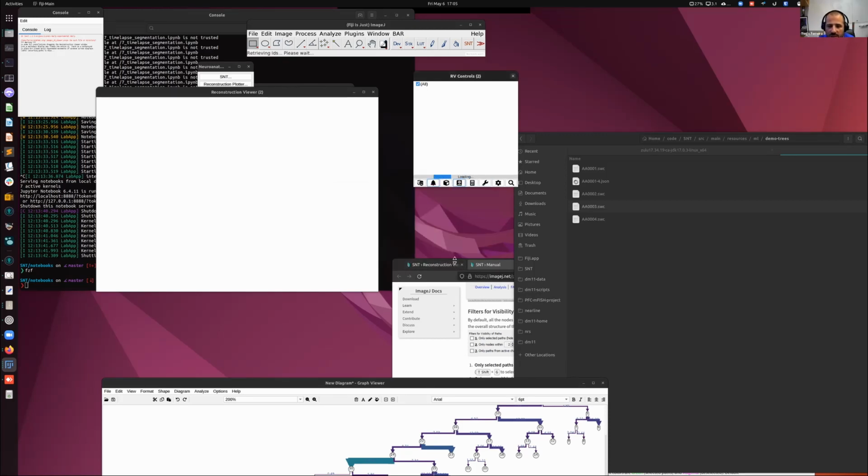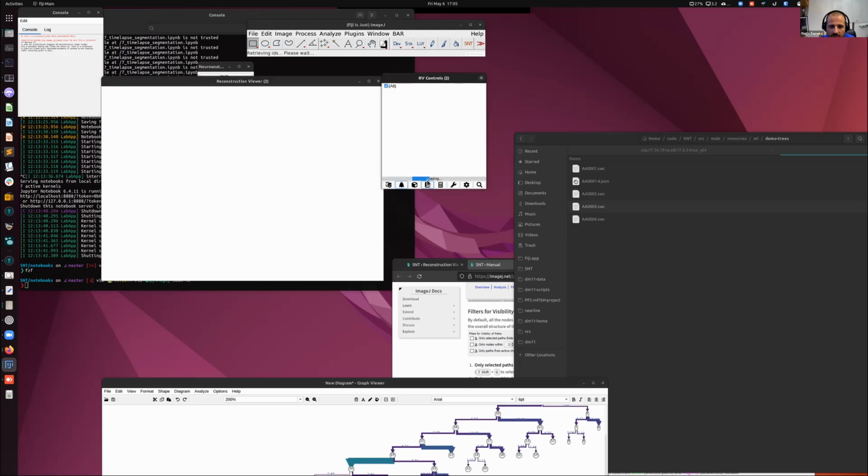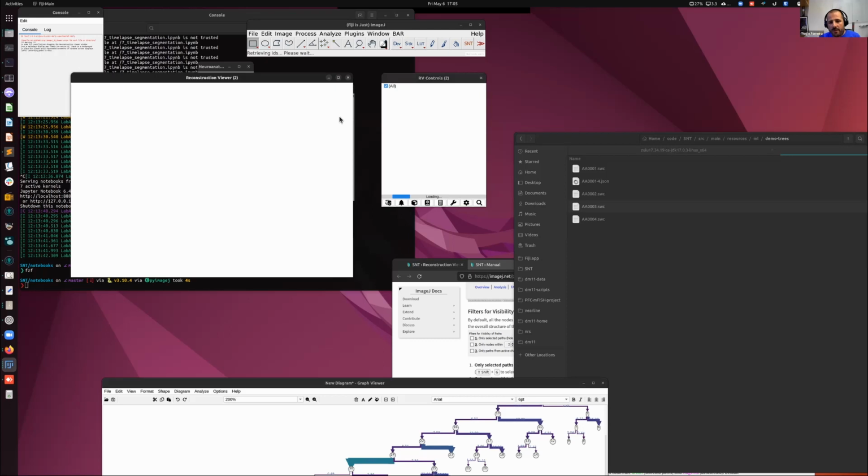And in terms of scripting, the API is constant. These neurons are quite large, so it will take a while, depending on accessibility. Meanwhile, we can load the reference brain too. In this case, we want to load the mouse brain.